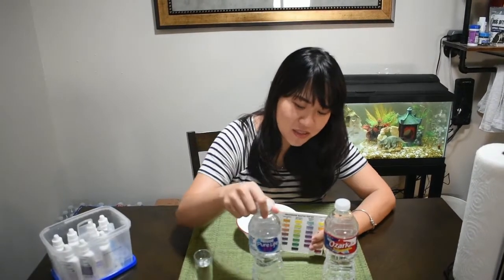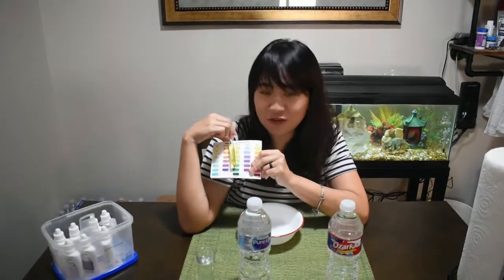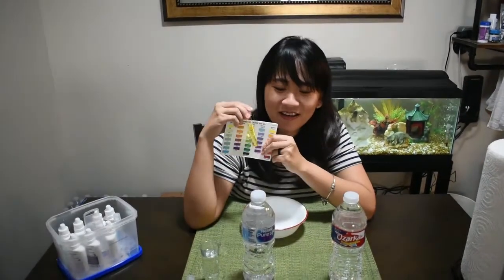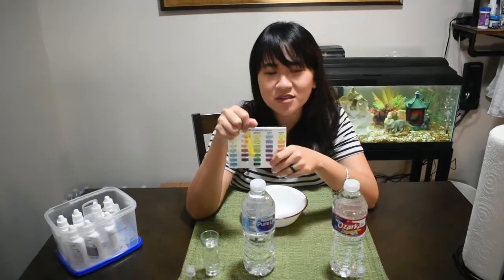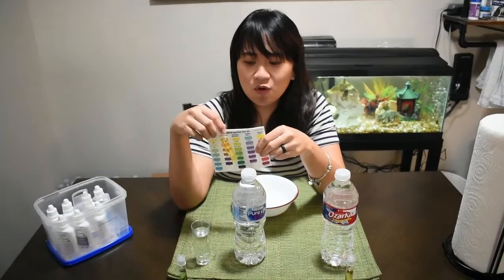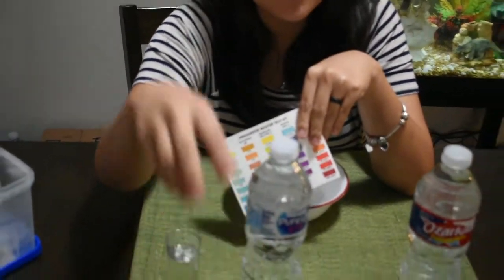And let's see the result for number 2. This is my water I usually drink. It looks yellow. There's no ammonia in it. So I'm lucky. And I like to stick with Nestle because in my country, Indonesia, I drink this too and we know this brand. So I like that. I like the taste too. And my husband likes spring water.